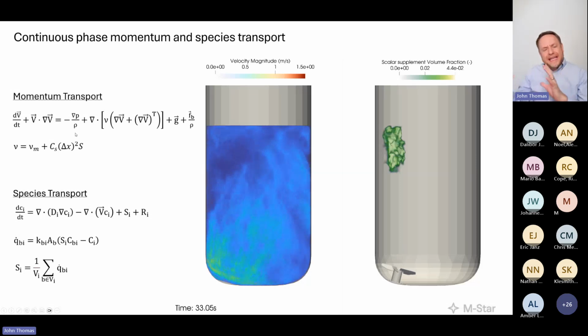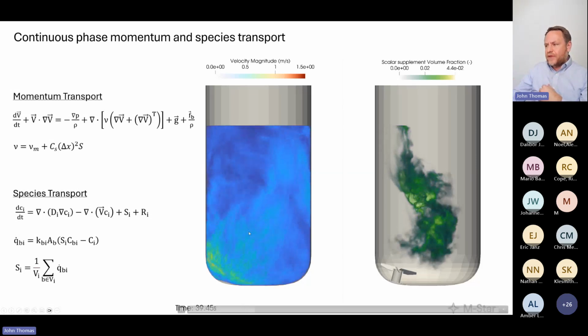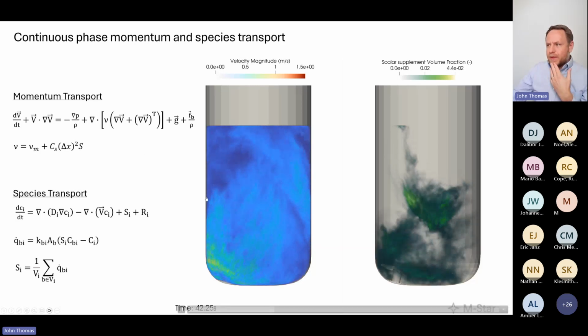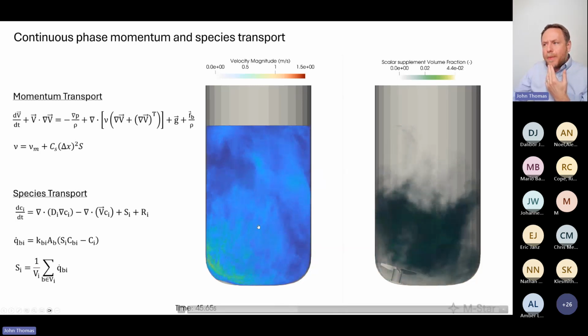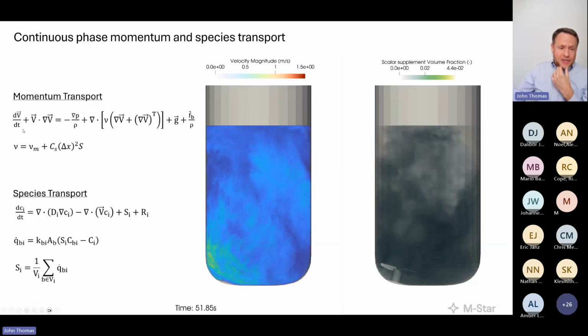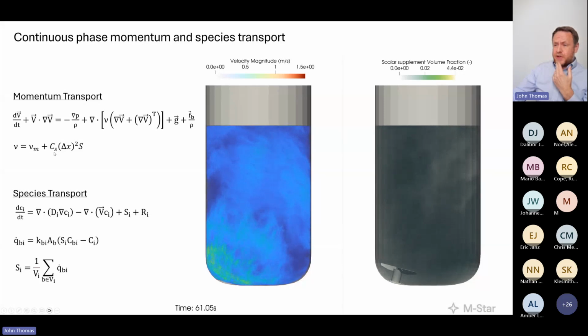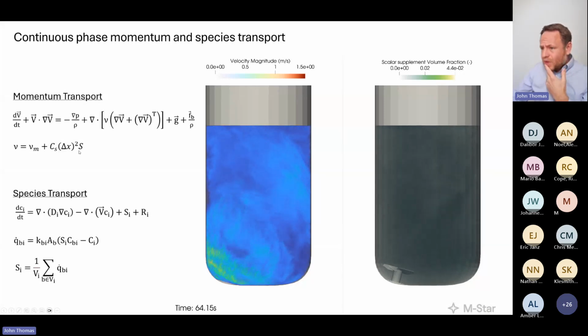Here are the key equations we're solving today. I didn't show Newton's second law for the particles, but that's easy to infer. We're going to be talking a lot about momentum transport as solved via the Navier-Stokes equation, represented by an LES model, where I use the Lilly-Smagorinsky model that informs the local viscosity from the Smagorinsky coefficient and the local shear rate.